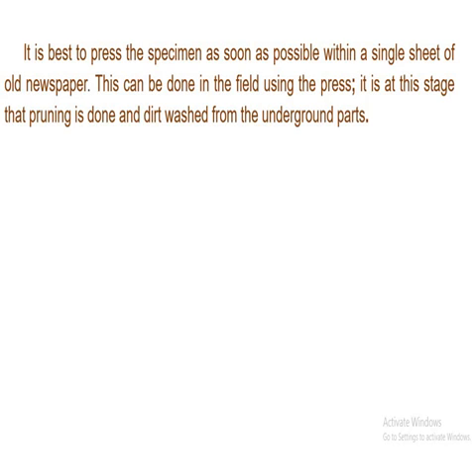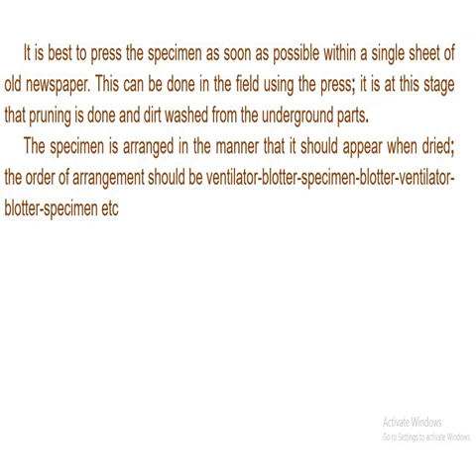The roots will have some soil, so you need to wash at this particular point in time before the drying begins. Now usually the specimen is arranged in a manner that it will appear after it has dried. Remember, I told you that if you don't put some portions of the leaf facing up, others down, it will not be possible for it to turn once dry, because they will just break.